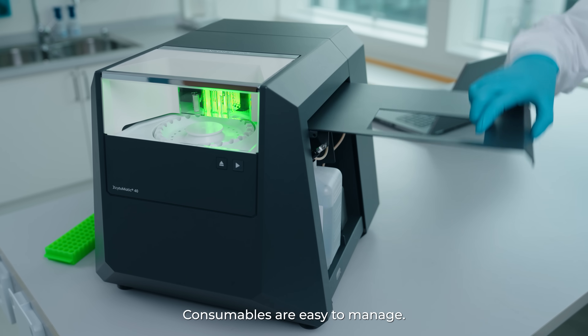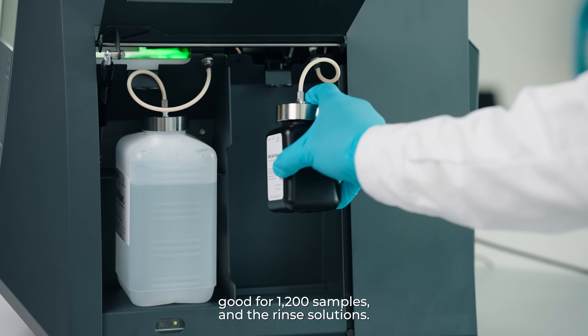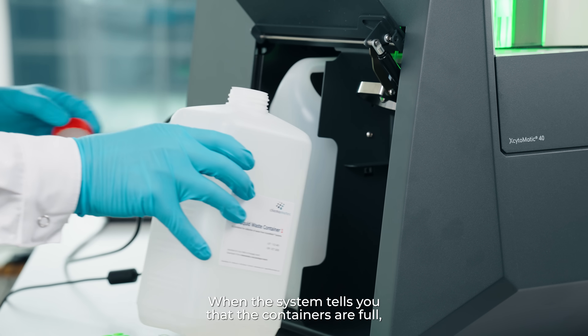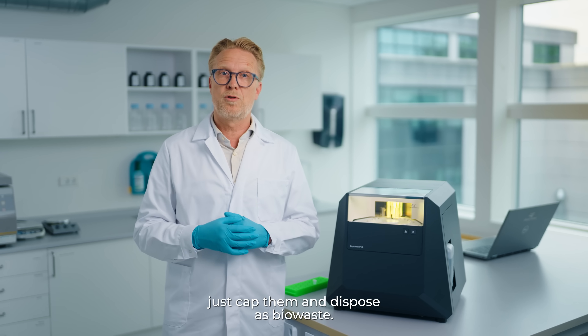Consumables are easy to manage. On the right hand side, we have the staining solution, good for 1200 samples, and the rinse solutions. On the left hand side, we have the waste containers. When the system tells you that the containers are full, just cap the containers and dispose as biowaste.